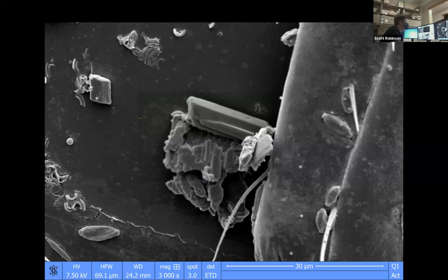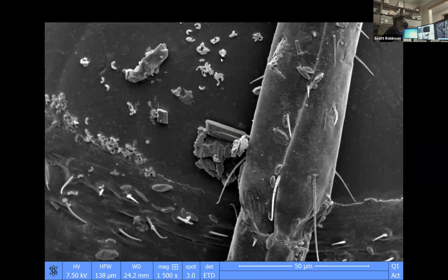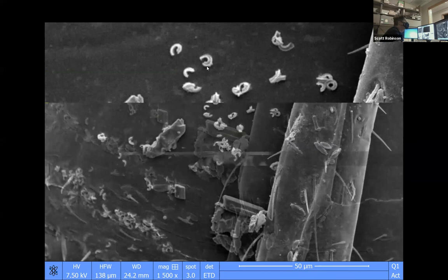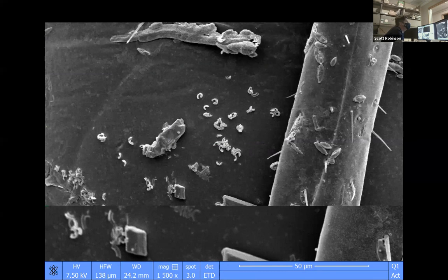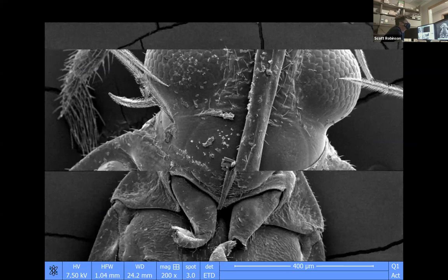So sometimes we see little crystals on the insects' faces. Sometimes we see little waxy features on here. These little wax things that we're looking at right now, we find them on mites, and we wonder if maybe this assassin bug was eating mites, or maybe there are some mites around here. So sometimes we'll find mites on insects. Unfortunately, we haven't found any on this set of insects that we're looking at.